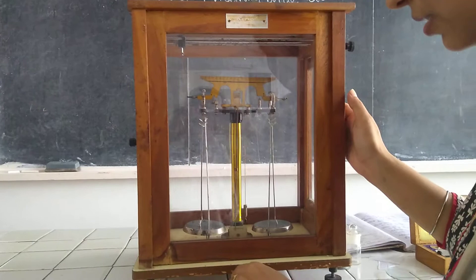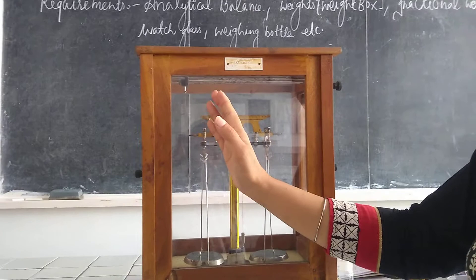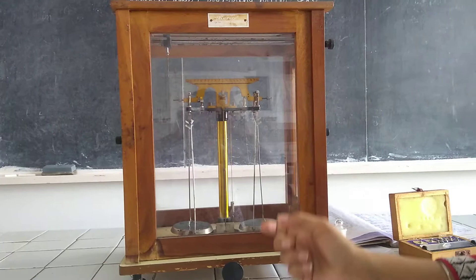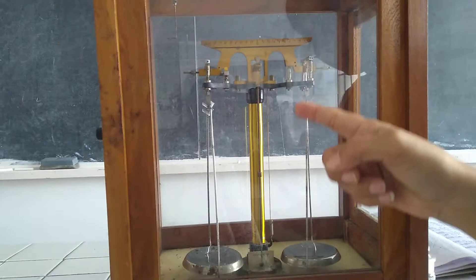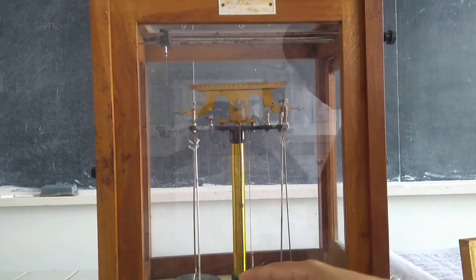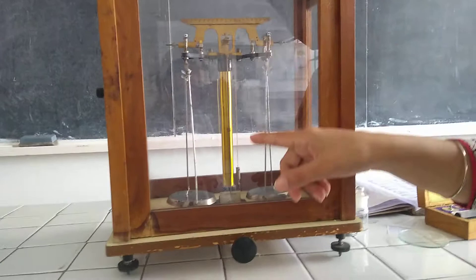This is our horizontal beam and it has graduations on both sides — 10 on the right-hand side and 10 on the left-hand side. This knob is used to monitor the pointer scale. The yellow line in the middle is known as the pillar, which supports the horizontal beam and the pointer. The center portion is known as the pointer, which always oscillates on the pointer scale shown below.